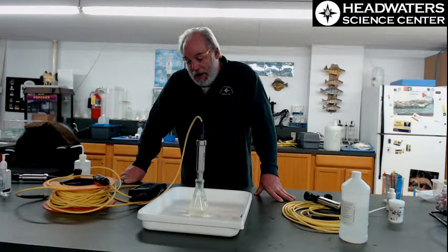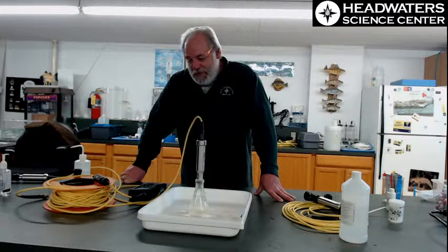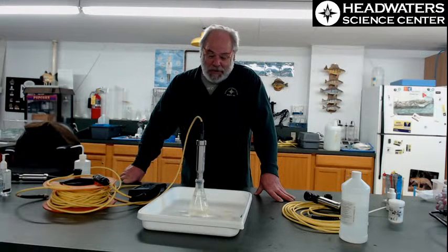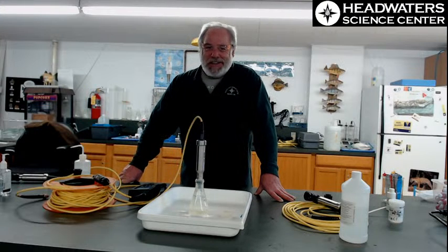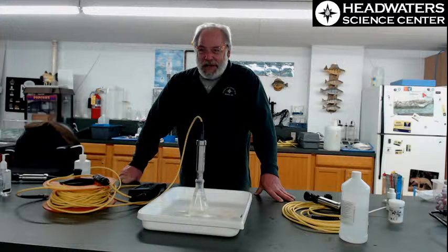So the meter actually is moving, but very sludgily, so it truly probably needed a calibration here. This is one of my newer probes, so it shouldn't be this bad, but if it won't go, we have to sometimes start it up again and try it again. But it looks like it's starting to close in, and while it does that, I think we can't just hold your attention out here. We're going to call that the how-to on calibration, and you can refer to this video for some sense of that.